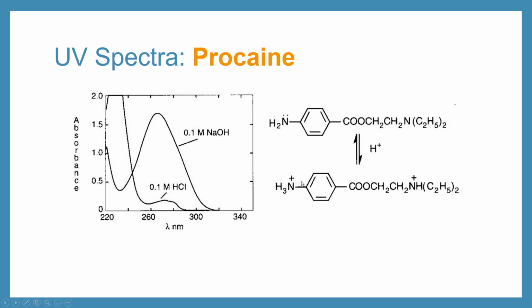Okay, and what we're seeing here is in two spots, both around those nitrogens. So we have an ammonium group here, so that's the NH3 plus, and we have that being deprotonated here to NH2, and you can see the lone pairs of electrons available. And then we can also see it on this amino group here, okay, so protonation and deprotonation. And we can see that it has quite a big impact on the spectrum.